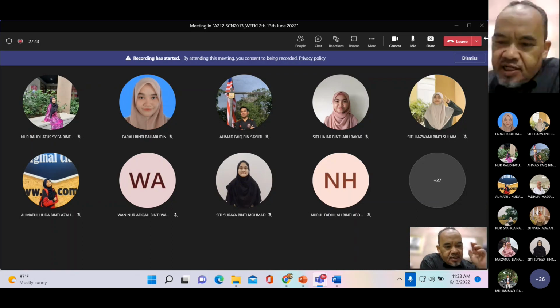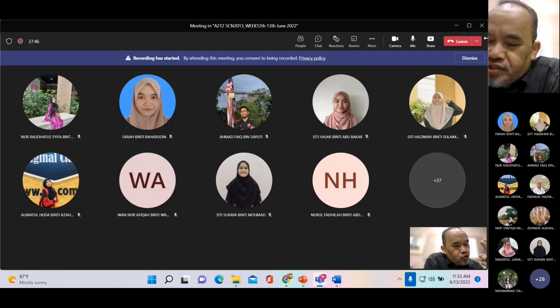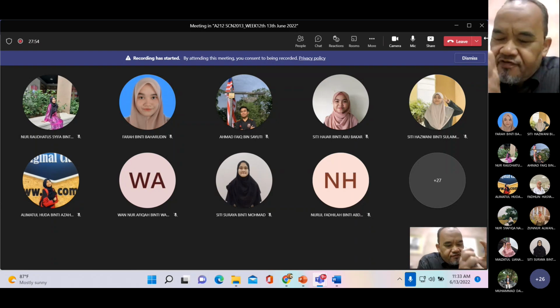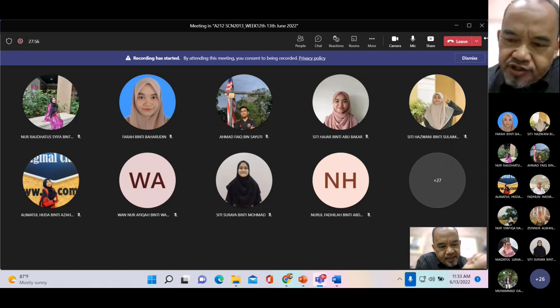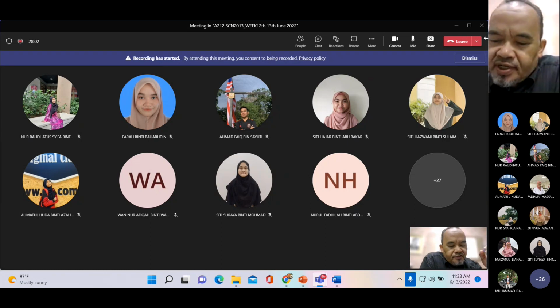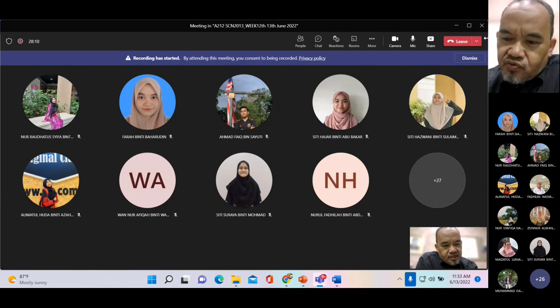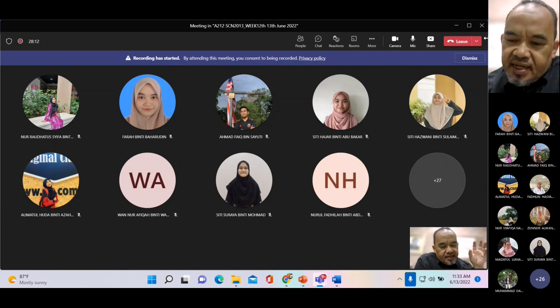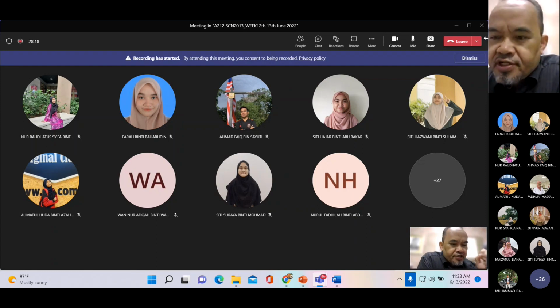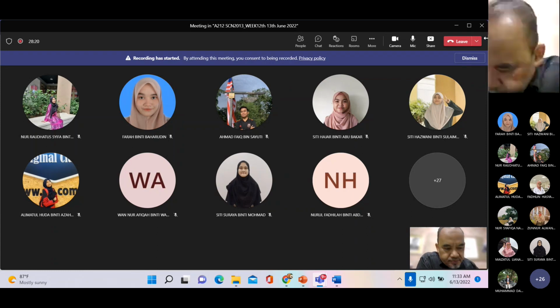Released energy can be of two types. They can release it in the form of heat. If it is in the form of heat, you can feel the temperature of the container increasing. But we prefer the second option, whereby the energy is released in the form of fluorescence, or emission, because we want to measure the intensity, and that intensity gives information about the concentration of your analyte. Okay, it's good.